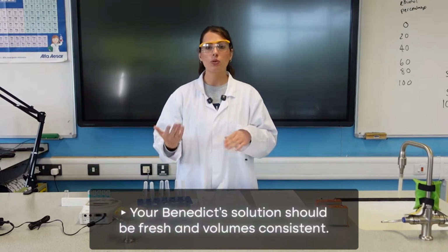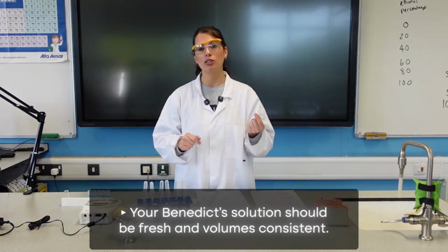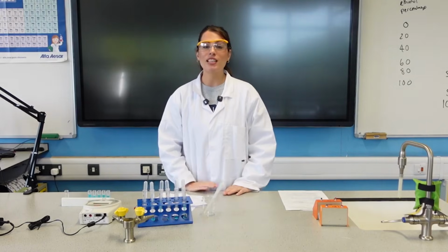And then with regards to that quantitative Benedict's solution, it does work best if it's fresh, and you need to make sure that you are adding the same volume every single time, because that's going to affect the amount of precipitate that would form. So that is it for this required practical.